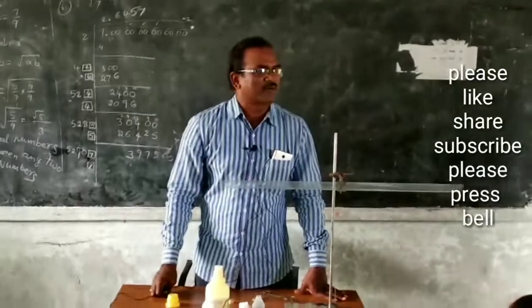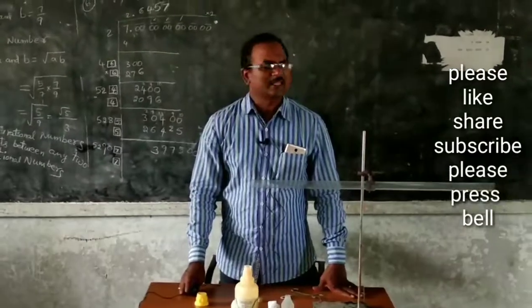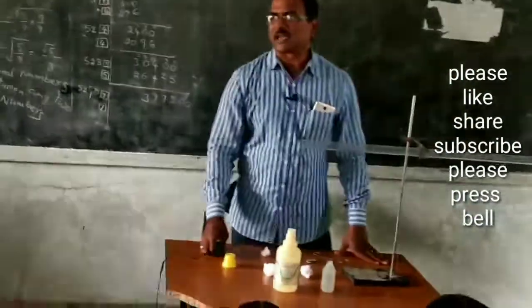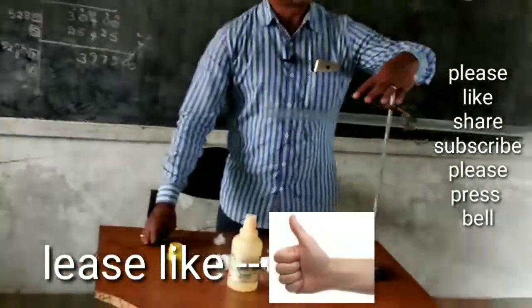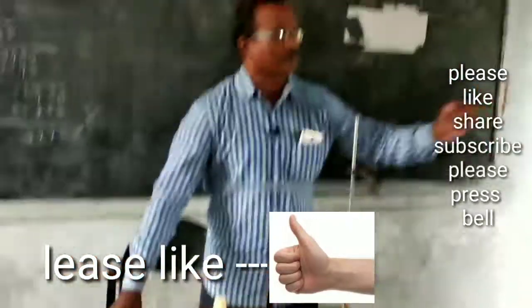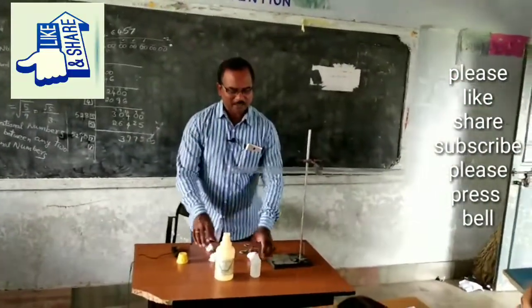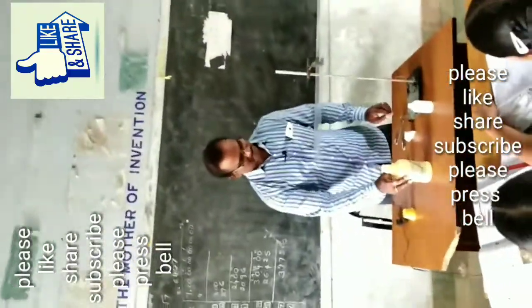The aim of our experiment is the rate of diffusion of gases. Apparatus required: a retort stand, clamp, two-side opened long glass tube, two cotton balls, hydrochloric acid solution, and ammonia solution.